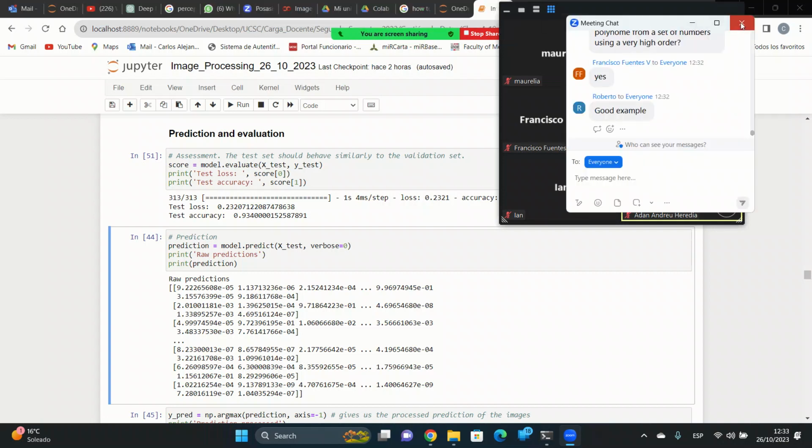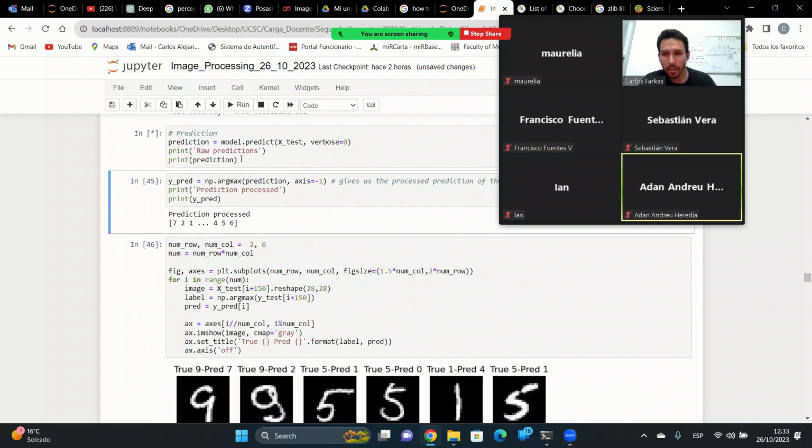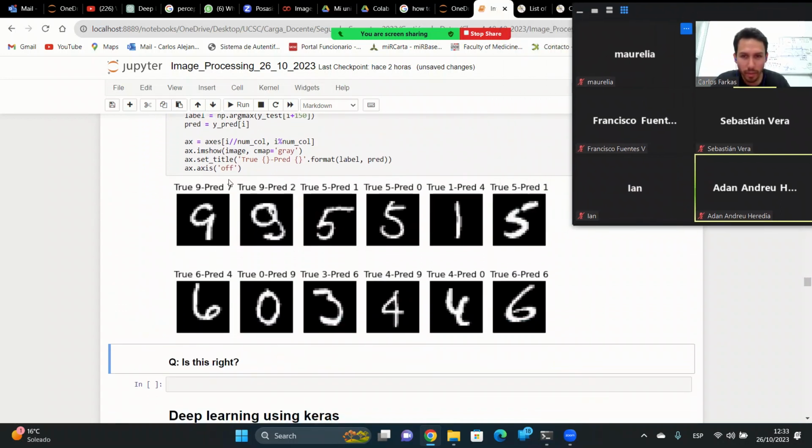Basically, that's just one example of how well a convolutional network could generalize within models, within data, and not just learn your data and be very good at this data, but when you change the scenario, everything falls down. And the prediction: this is just the NumPy predictions. It's not very important. And this is the matplotlib plot. So we'll see what's going on here.